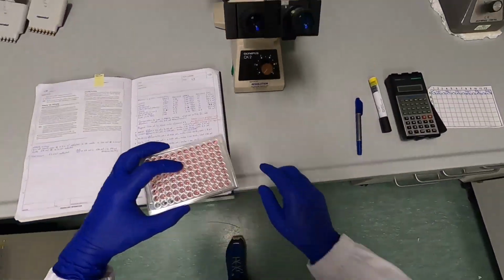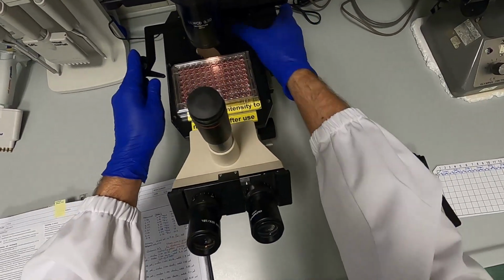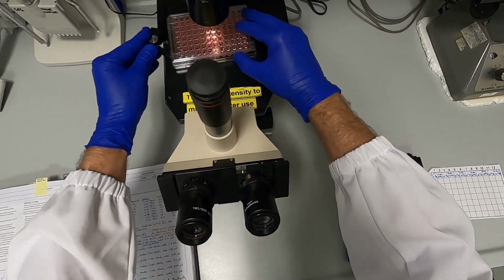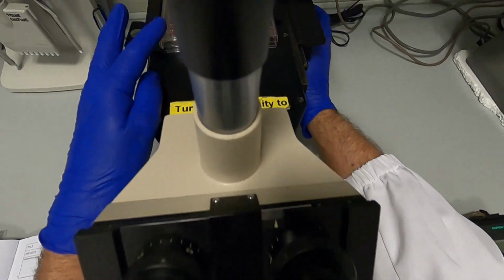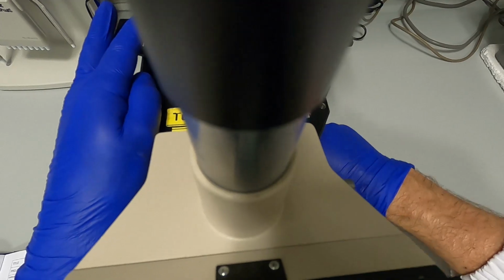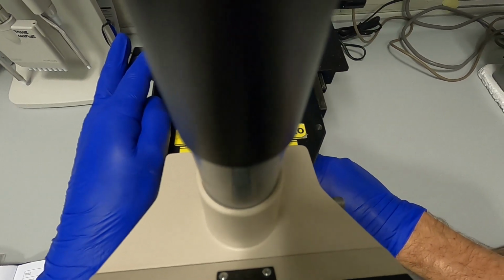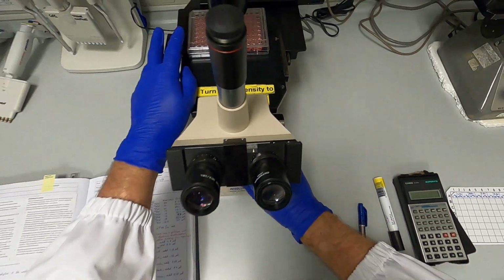Does everything look okay? I know you already checked, but still, it never harms to check again. Cells look fine. Okay, we're ready for the next step.